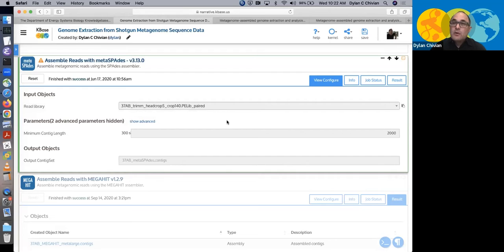One thing to note is metagenome assemblers will produce any joining of reads that they can. But like with lineage abundance, you also get this very long tail where often most of the contigs are very short.